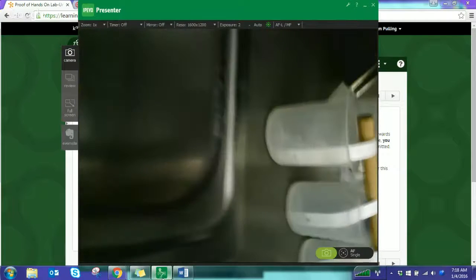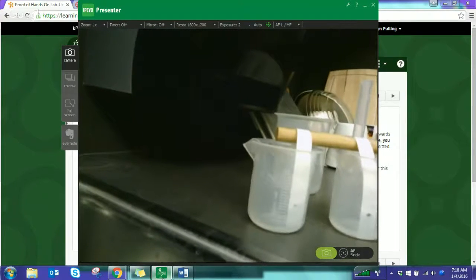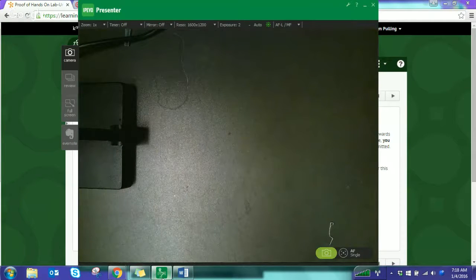Okay, so here I have them set up like that. So if you have a stopwatch, go ahead and start that for 20 minutes. I'm making note that it is 7:18 right now. So I will look back at that later. All right, so now we're going to move on to part 2 and get that set up.